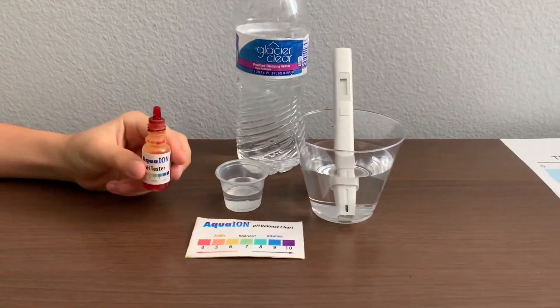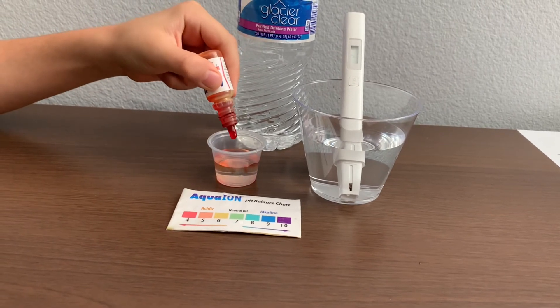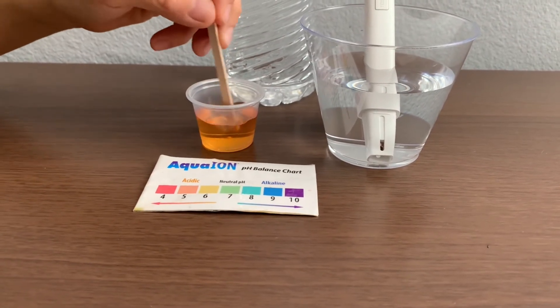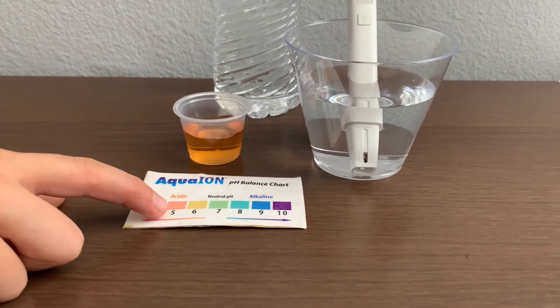Now let's test the pH level. Only do two drops. Let's stir it a little for a better result. I give this a 5 — this is acidic.